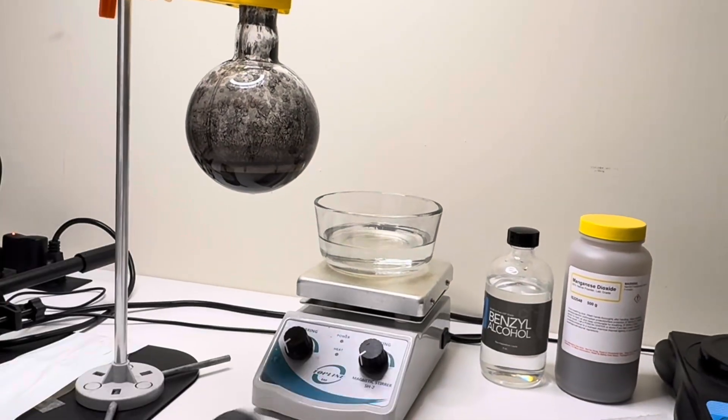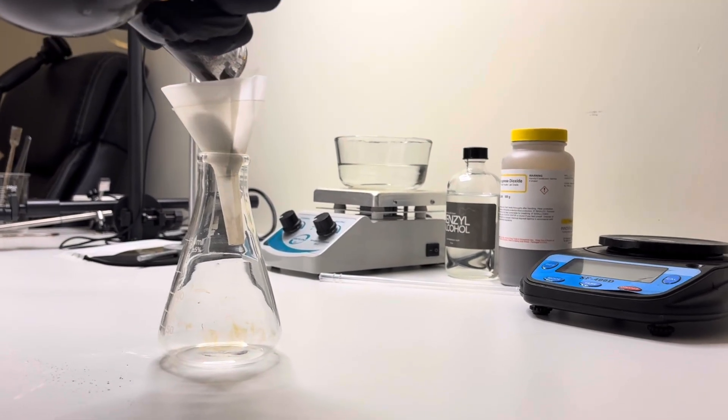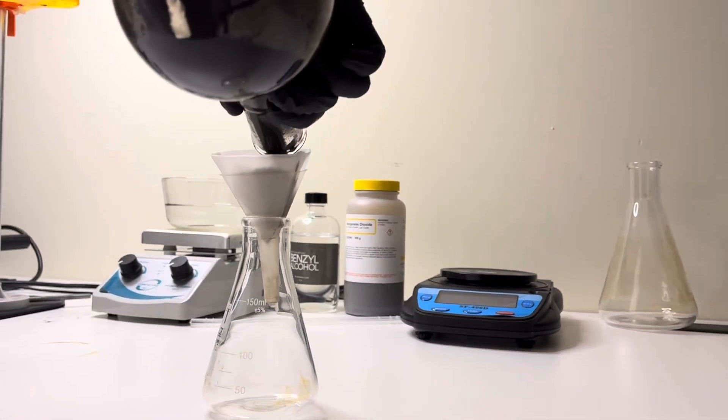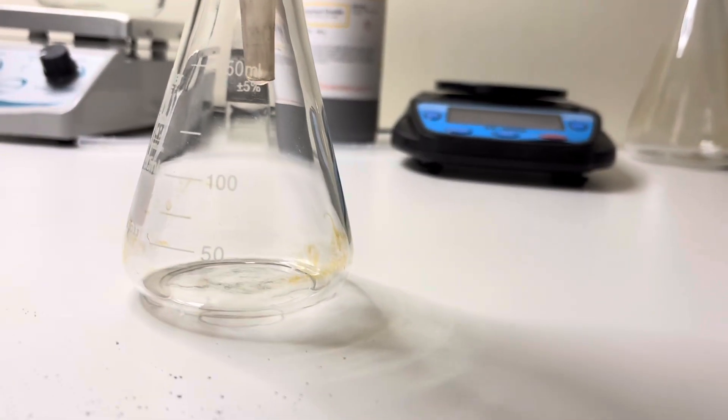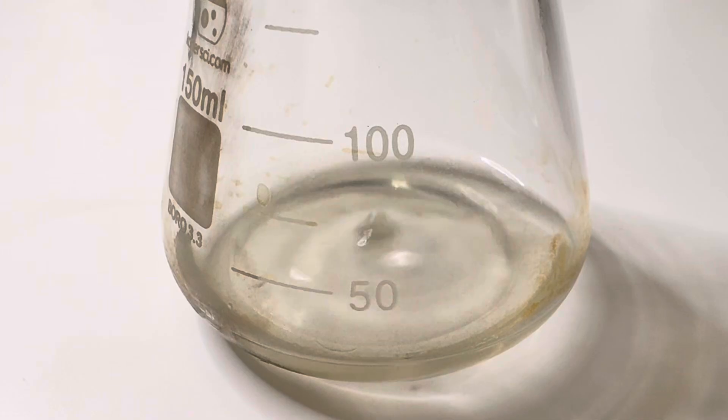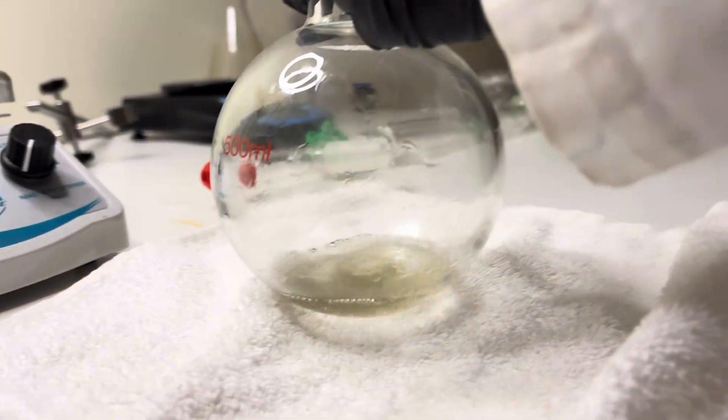That black solid is spent manganese dioxide. I'll separate it out using gravity filtration. The clear liquid contains our target product, benzaldehyde. It still needs to be purified to separate it from the acetone.